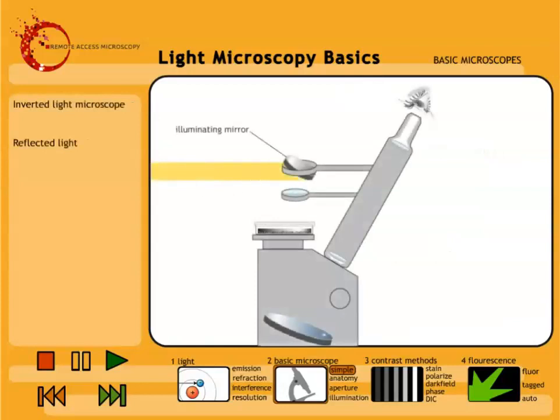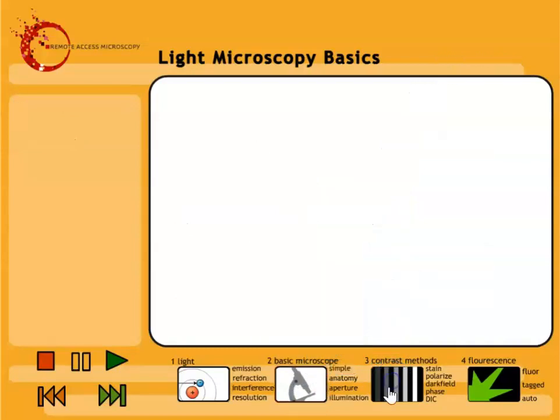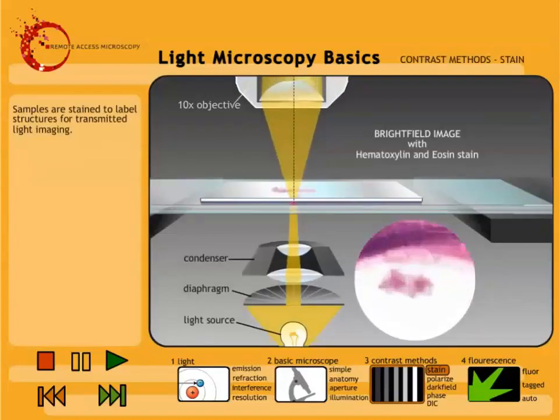Light microscopes may illuminate the sample from the opposite side of the lenses, known as transmitted light, or illuminate the sample from the same side as the image-forming lenses, known as reflected light. Modern contrast in biological tissue sections can be enhanced by staining the sample.